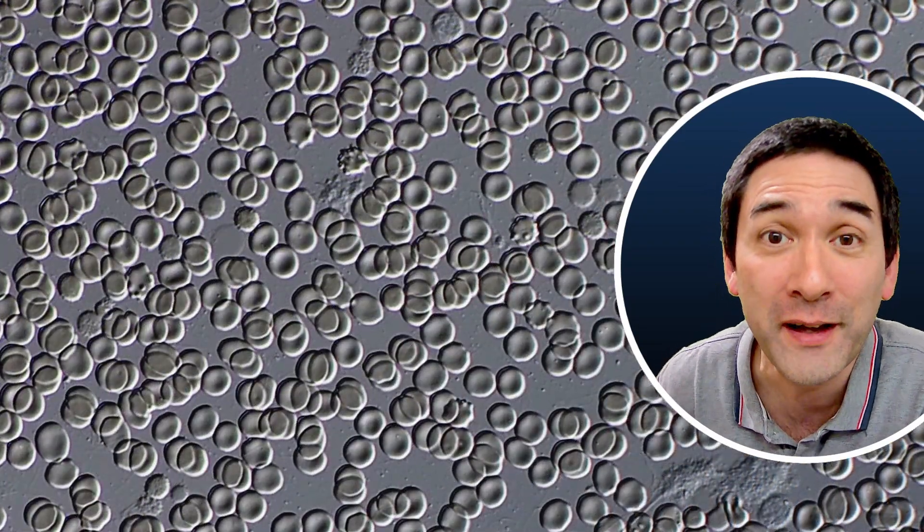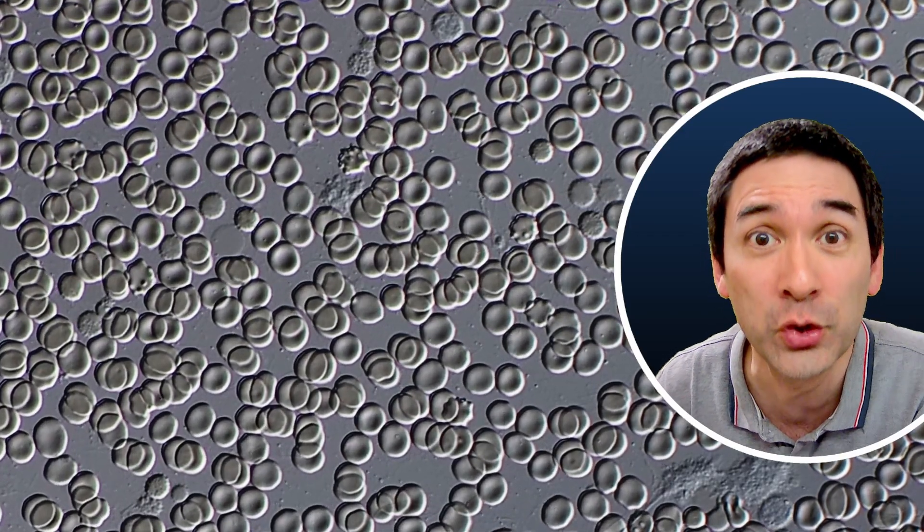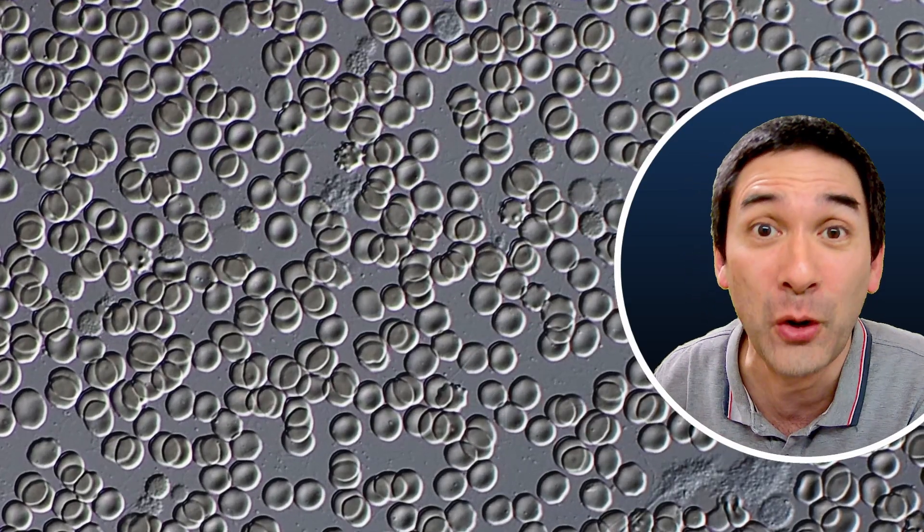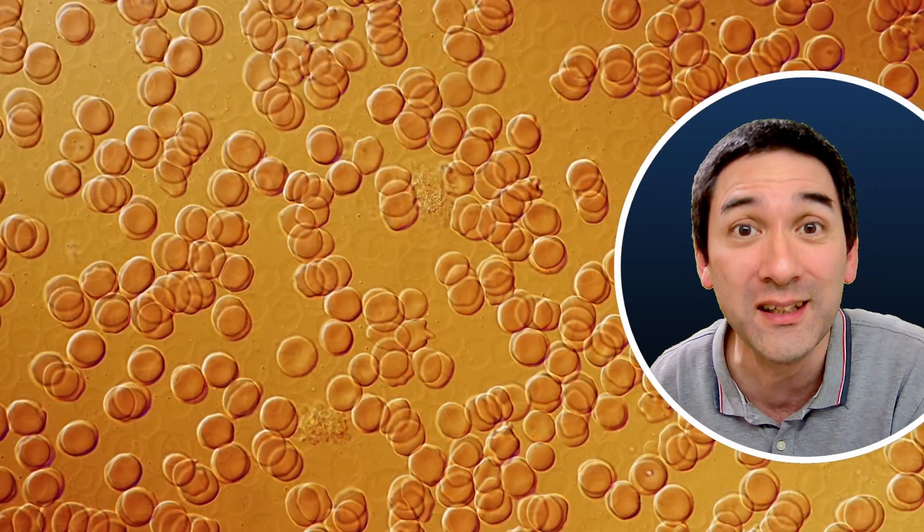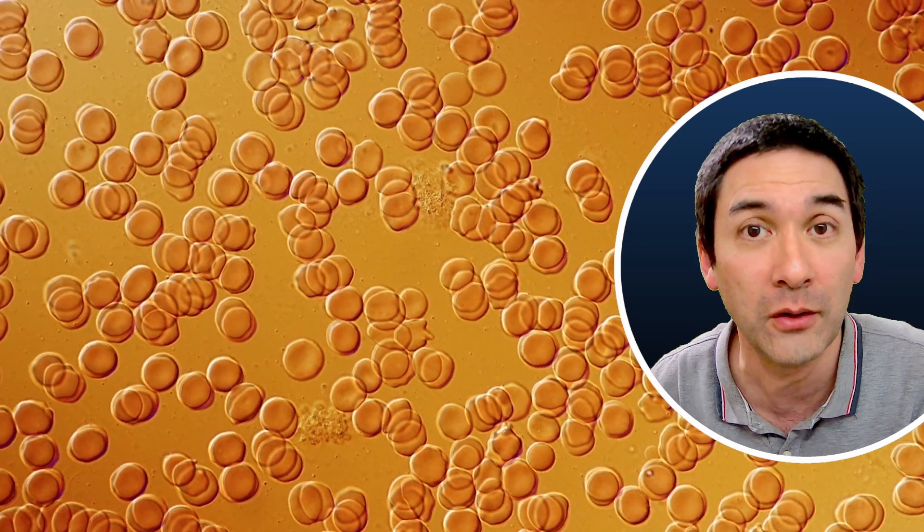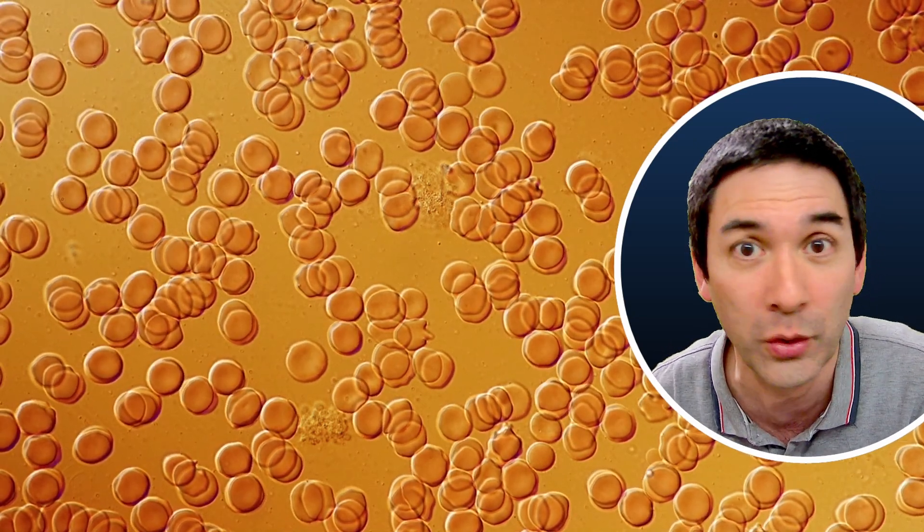We're going to find out today because I'm going to be adding a little bit of salt water to red blood cells. These are the ones that you see in the background here. Also to paramecia, which are single-celled microorganisms and also to onion cells. And all of these cells, they don't like salt water at all.